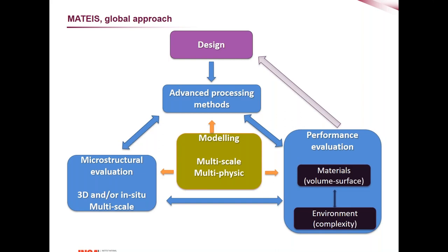So definitely, you can see the Gleeble at different points. One on advanced processing methods and one on performance evaluations, but we also use the Gleeble on the design approach. I will talk just a few words about that later.